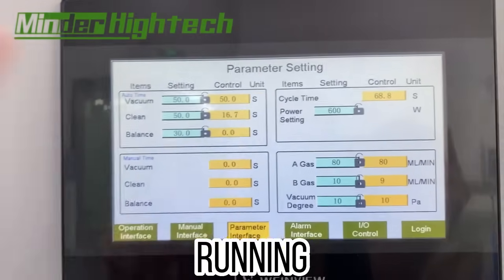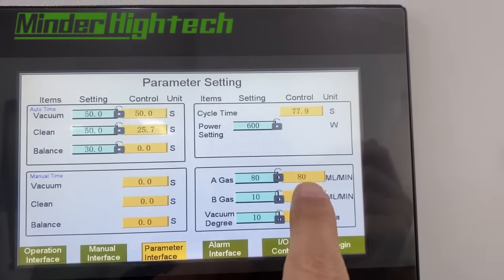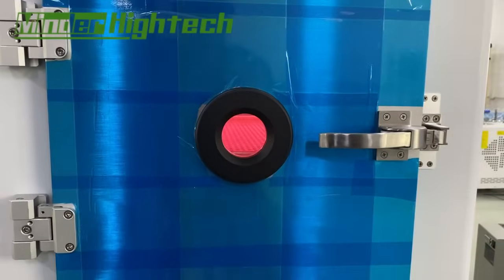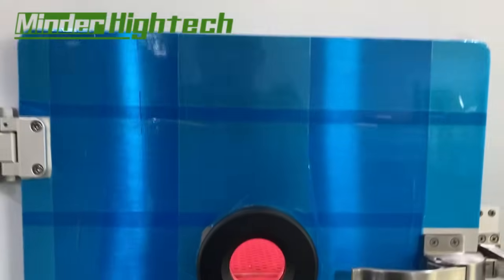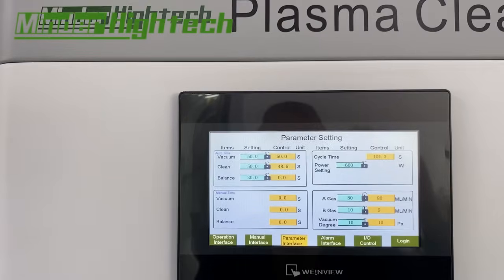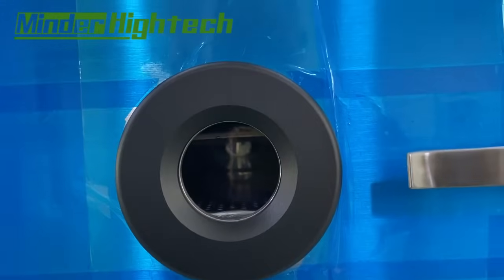This is the clean time phase. We set only 50 seconds to keep the video shorter. You can see the gas A and gas B indicators. Note that we are not connected to the gas sources in this demo. We just wait for the process to complete.